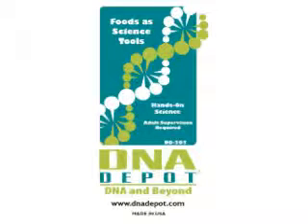DD205. The objective of this experiment is to determine that certain food components can act as biological indicators and be useful biological tools as components.